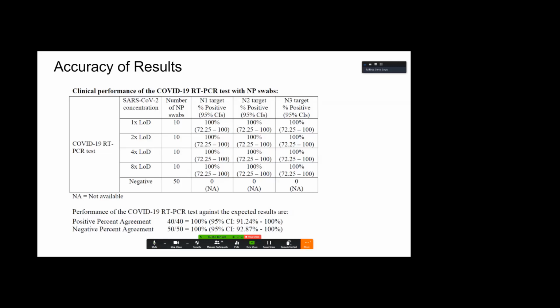So these are 2-fold dilutions. And then they said, we didn't put any virus in this sample here. And they're saying that in their PCR testing, they got 100% accuracy: everything that should have been positive was positive, and everything that should have been negative, no virus here, was negative. So this was encouraging for me to see that in LabCorp's hands, with maybe a little bit cleaner sample than it would be in real life, because they put the virus in artificially, their test worked flawlessly.